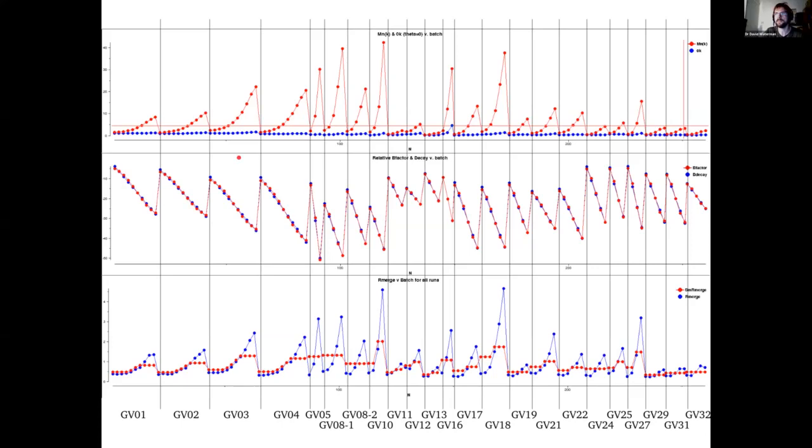So the main work in processing this data set was the job of determining the right radiation damage cutoffs and excluding particular data sets and that's a familiar task for anyone who has combined many small wedge x-ray diffraction data sets too. So there's nothing really specific to electron diffraction about that.